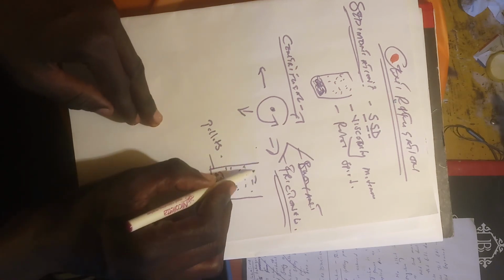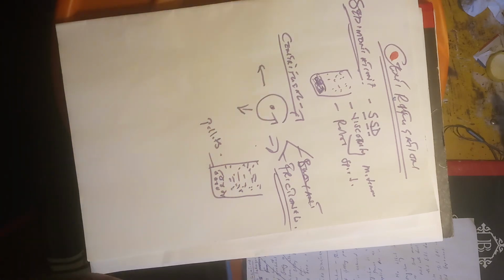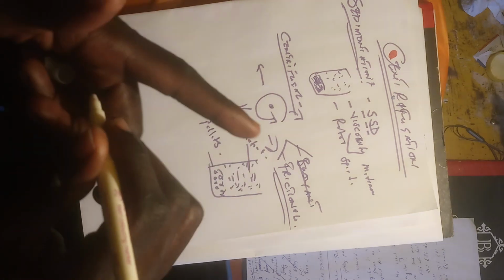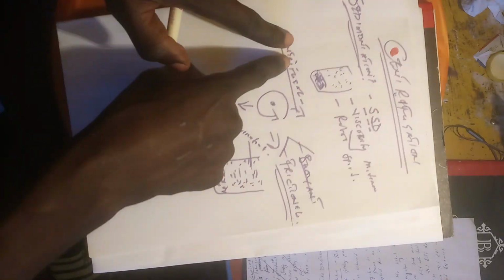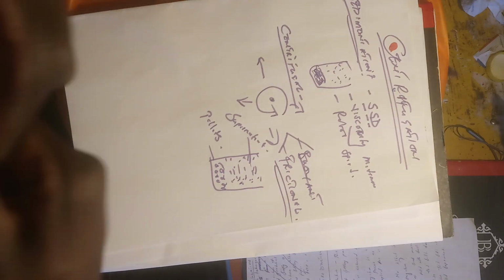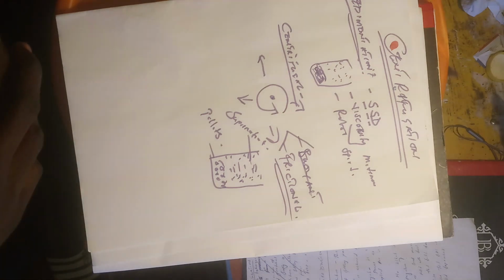And you have the lighter liquid phase or any lighter phase; if the solids are lighter, you'll find them on top as the supernatant. So that's how it is. When the centrifugal force exceeds these two forces, particles settle down there. They'll be denser than the lighter ones, and they'll settle there.